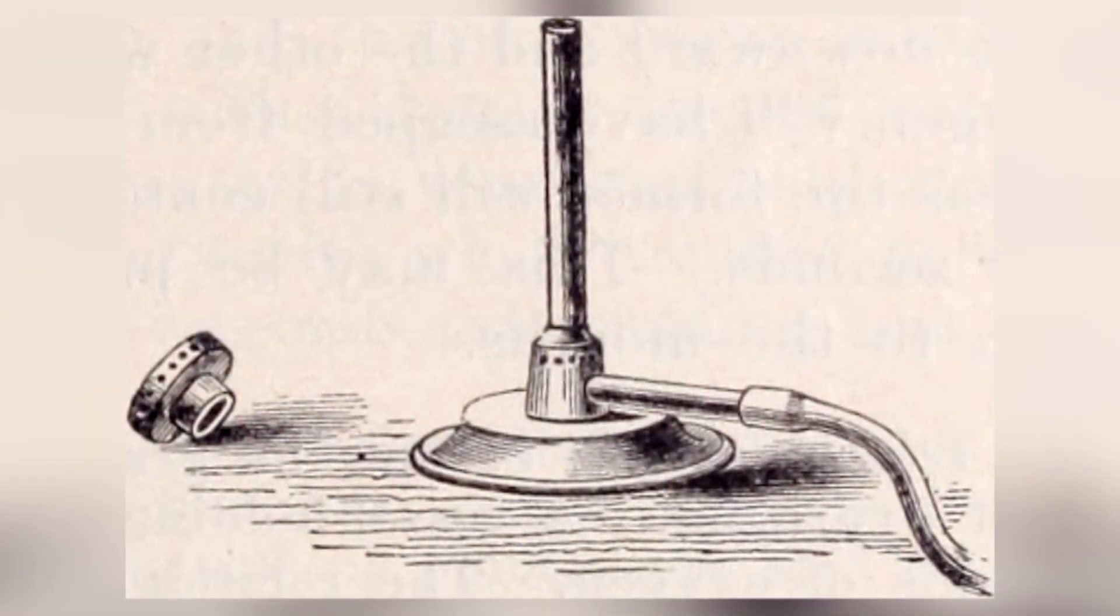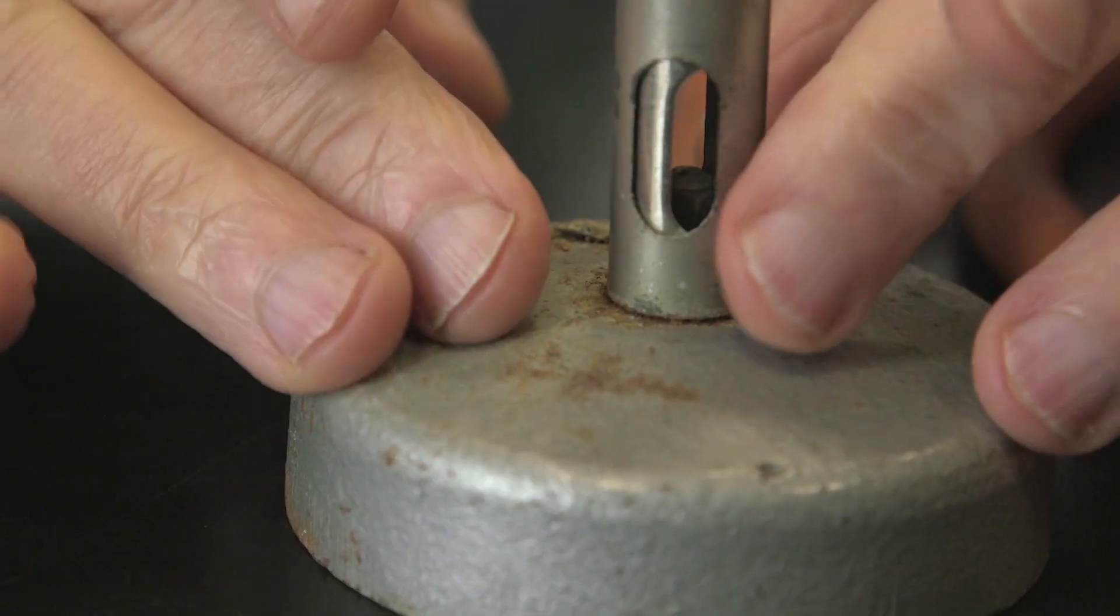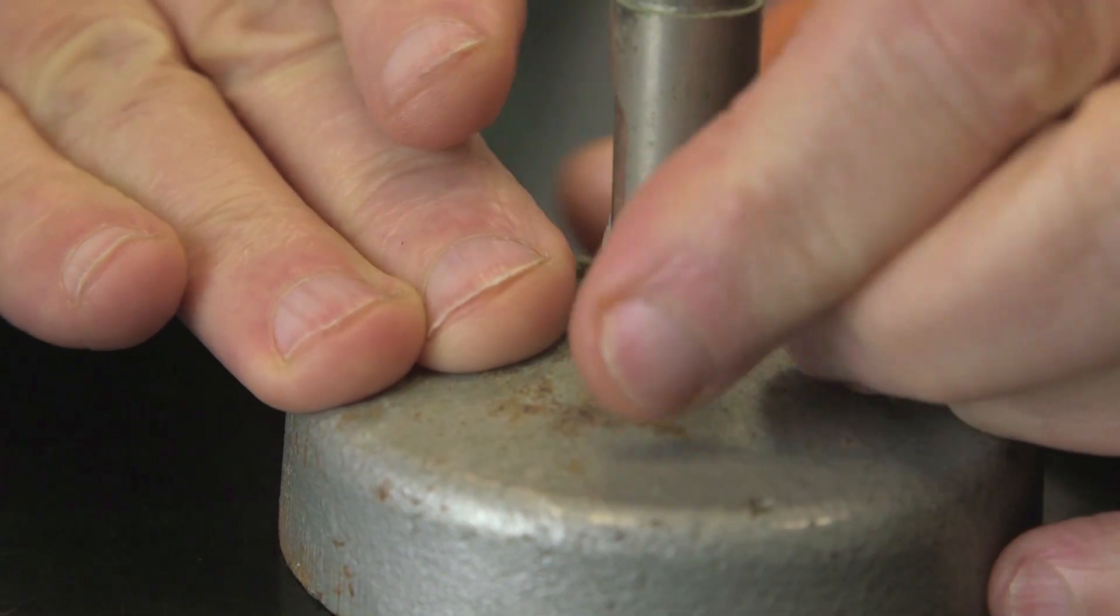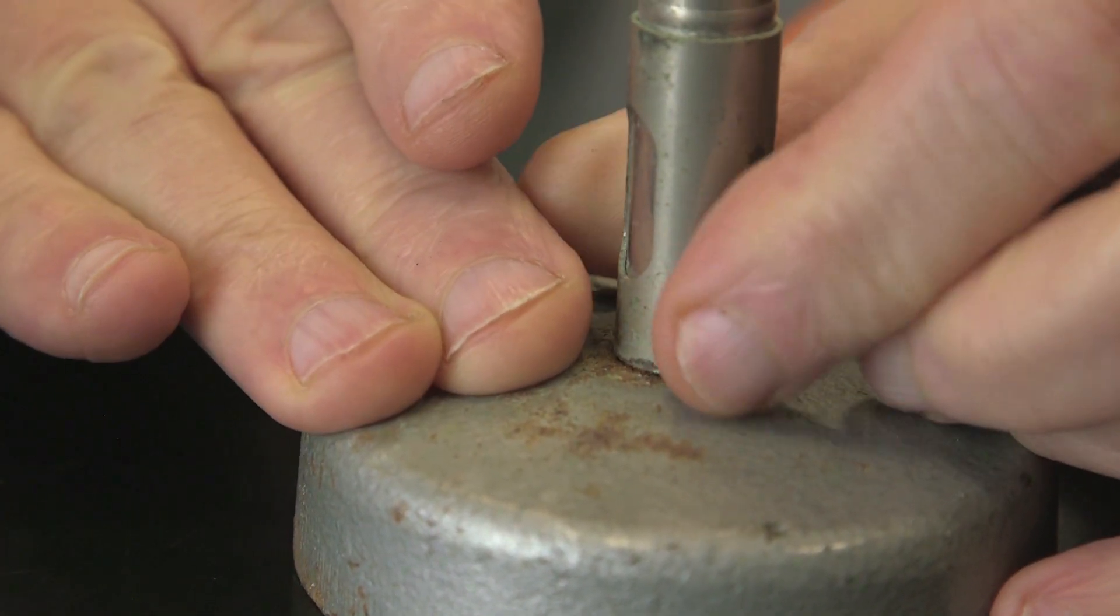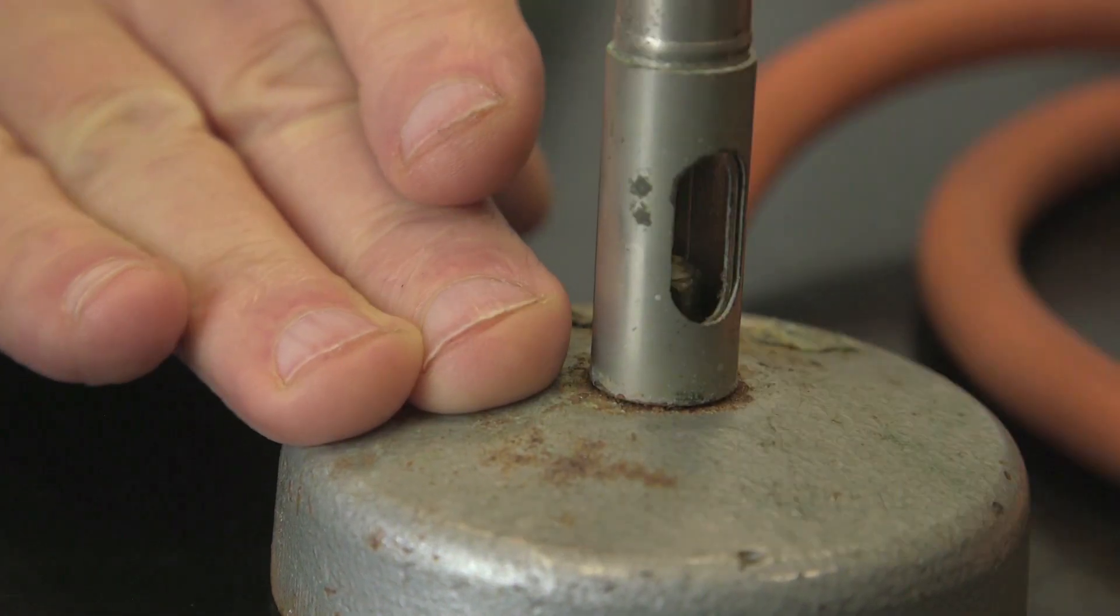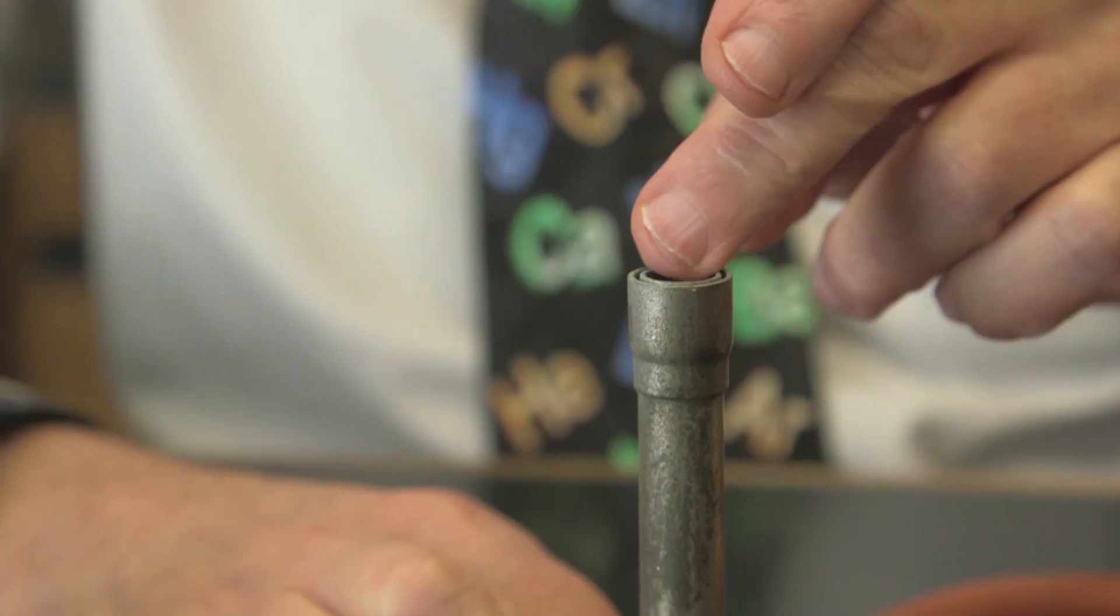The Bunsen burner is perhaps one of the most iconic symbols of chemistry. A Bunsen burner, just to remind you, consists of a small jet down here with two holes and a metal cylinder that you can rotate so that you can open and shut those holes. And the gas comes down the tube, up the jet, and air comes through these big holes and the flame comes out at the top.